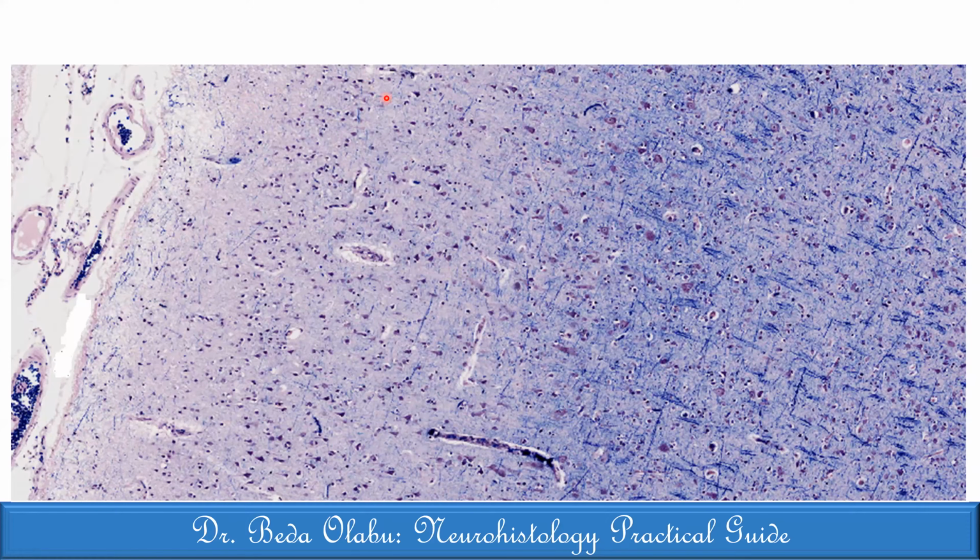This slide, we can see various cells transitioning from the left to right without distinct layers, but at the end they have transitioned, and there are also some fibers crossing. So this one I would say is the cerebral cortex. Very good, you're very right, and I like that description, very honest, and it's the one that actually helps. So this is the slide of the cerebral cortex.